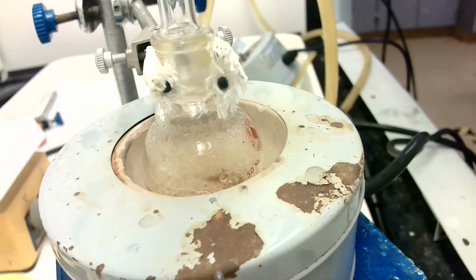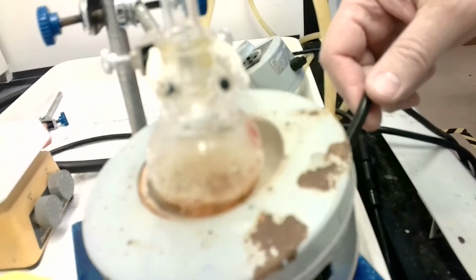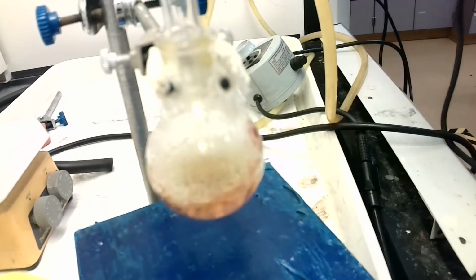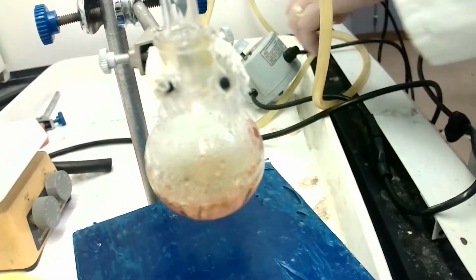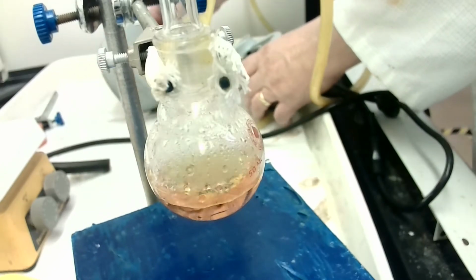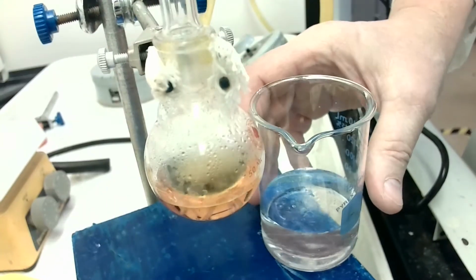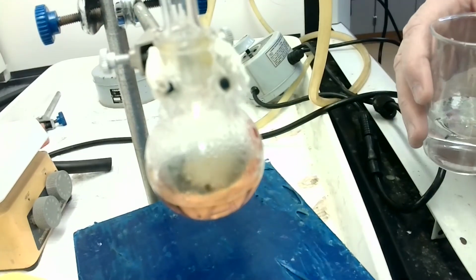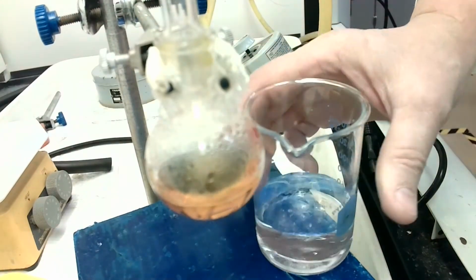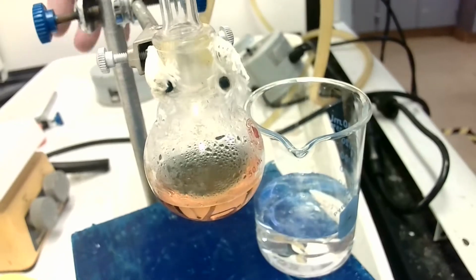Okay, we've been refluxing for an hour. We're going to now turn the heat off, let it stop dripping, and then we'll quench the reaction. What is it focusing on? There we go. How's the focus looking? That's good. It was kind of almost pinkish on the camera, but it's actually an orange color liquid. That again is due primarily to the aniline impurities. We'll remove the color at our next step.